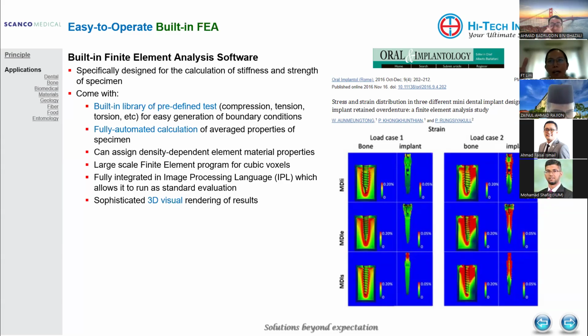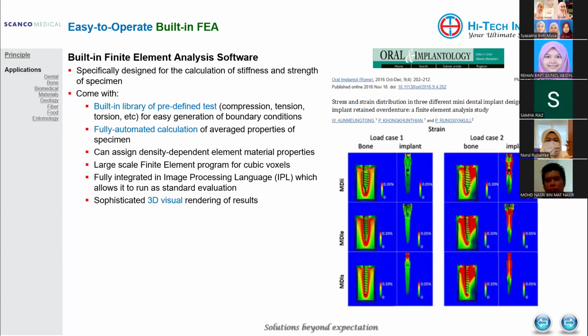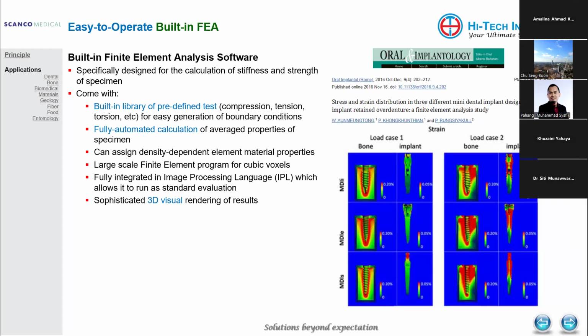And length is basically unlimited, because it's quite similar to the clinical type of CT scan. So length is not an issue, it's the diameter.